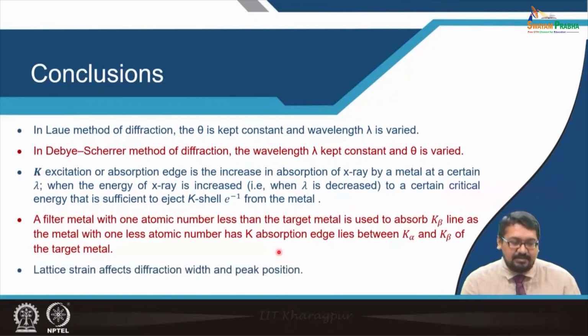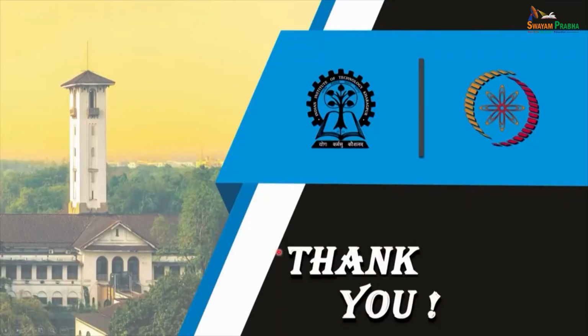One more thing, lattice strain affects diffraction width and peak position. We have seen that. Thank you very much.